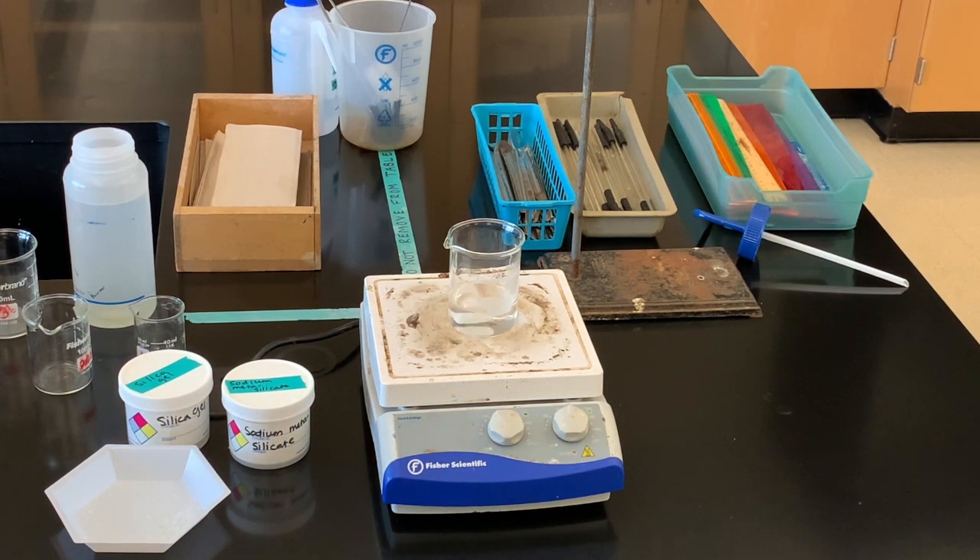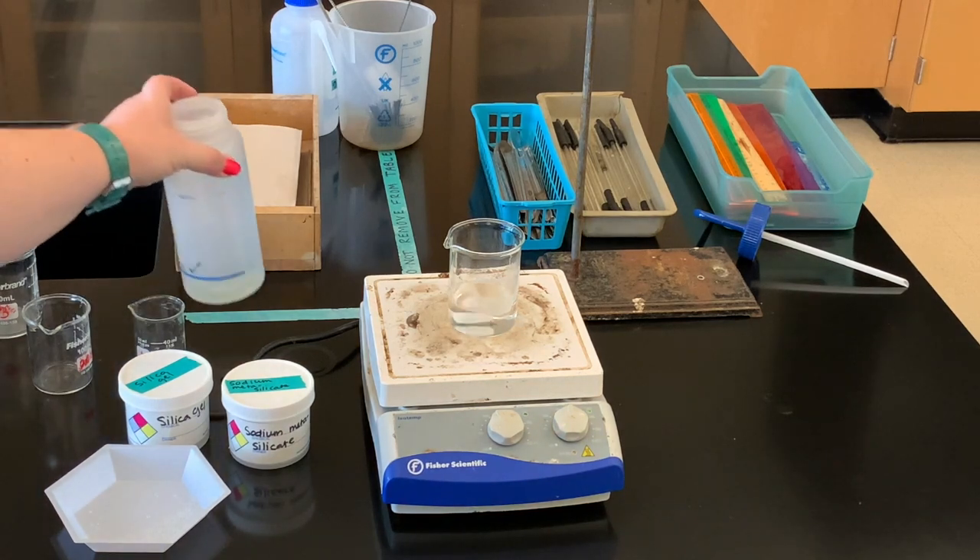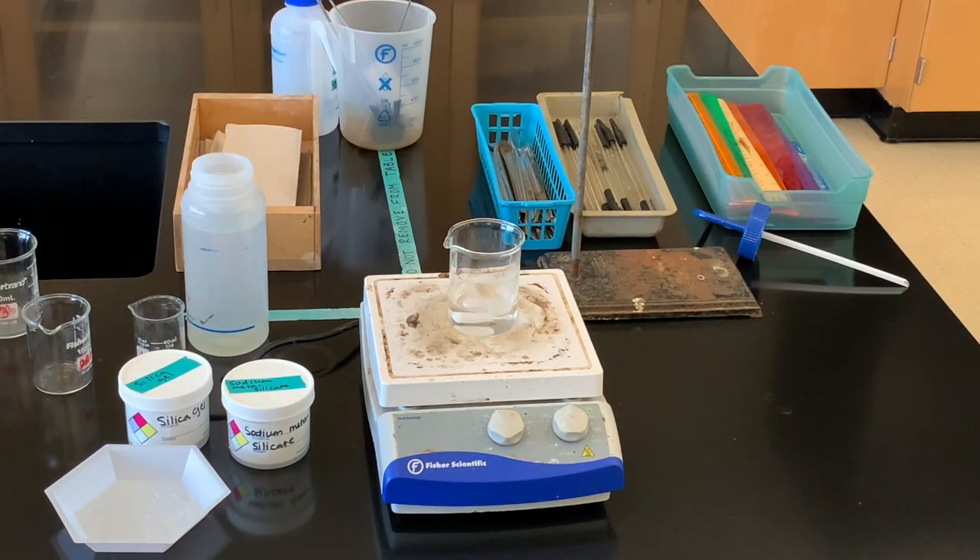I'm going ahead and starting this process and will just keep monitoring it as time goes on. If I need to add a little bit more water I will — I just slowly add that silica gel. I have some distilled water ready so that I can pour it into my beaker if I see that level going down.